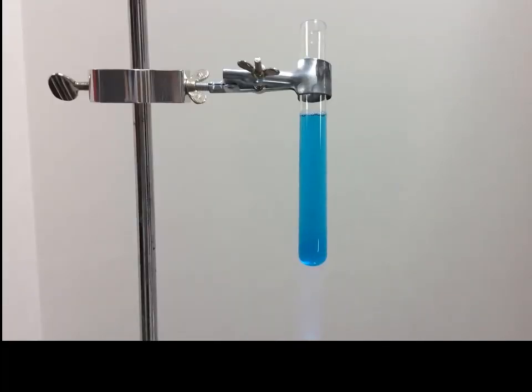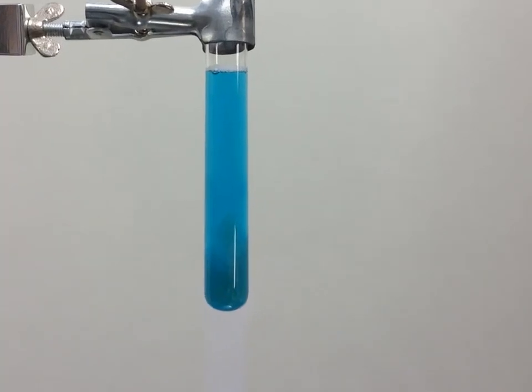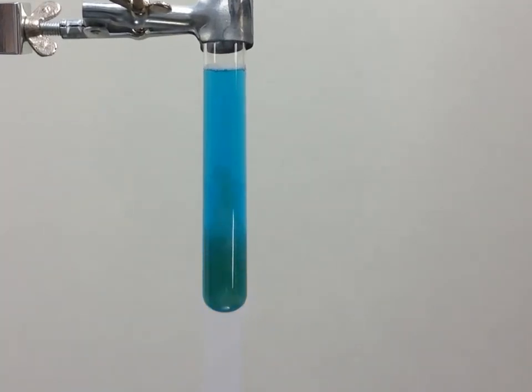Then we'll place our solution over a flame so that it can be heated and observe whether or not a precipitate is formed. It's very important that whenever you heat the contents of a test tube, you take the proper safety precautions.